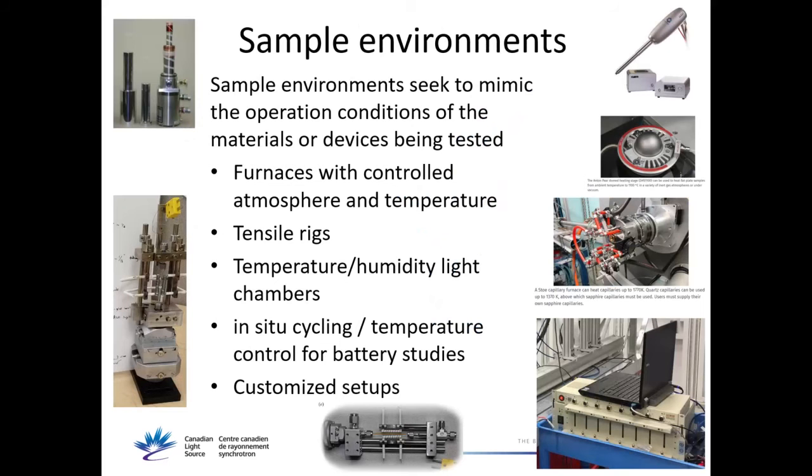So we have many different environments. Some of them we buy to control temperature, like a cryostat or cryostream, different furnaces. We have this battery cycler. We have this capillary furnace. So we buy environments following users' interests, what's going to get used more. Sometimes the users have a particular interest and they come here with a problem and they can develop their own environment for the particular case. We help and we support them in the development if they need.